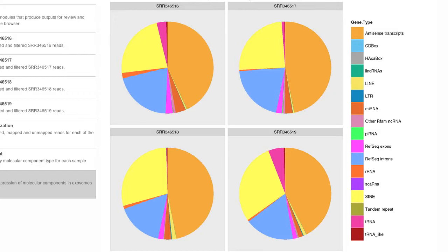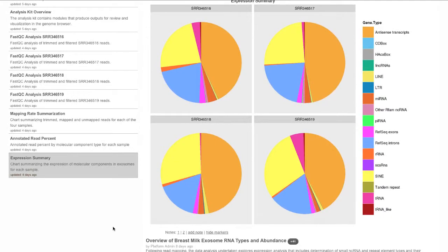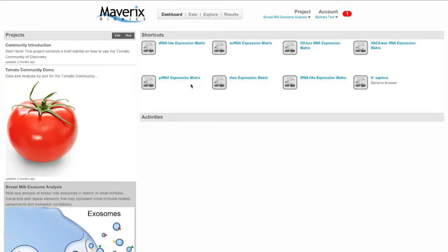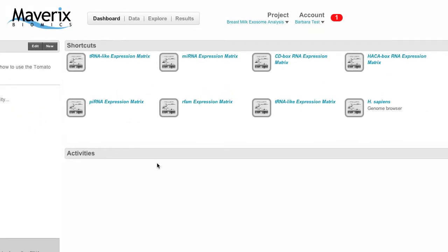If you plan to share results with your collaborators or just want to give yourself quick access, you can promote pertinent results from the analysis kits to shortcuts, which are bookmarked links accessible from the dashboard. These shortcuts from the exosome RNA-seq analysis represent an exciting way to visualize your data directly in the context of the UCSC genome browser. Here we find the differential expression results for the RNAs identified in our exosome samples. The RNAs are categorized by type — for example, tRNAs, microRNAs, and snoRNAs.